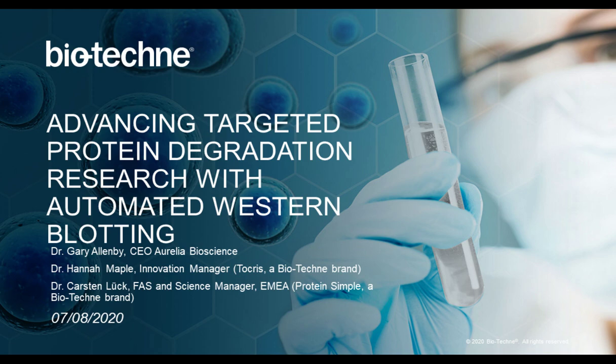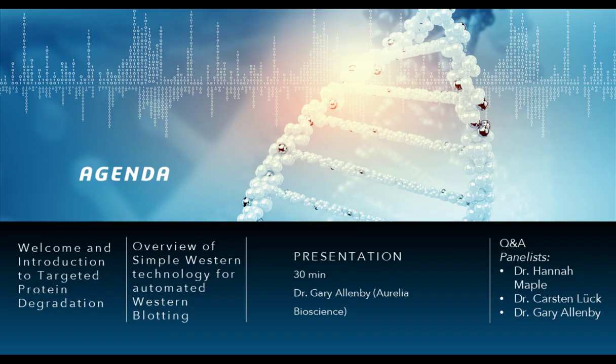This webinar will be approximately 1 hour long, and the agenda today is as follows. I will provide a short introduction to targeted protein degradation. My colleague, Carsten, will then provide an explanation of the simple Western technology that underpins the work that will be presented today. And then I will be inviting Gary Allenby from Aurelia Bioscience to present today's research talk. We will be ending with a live panel Q&A, so please do submit your questions to us using the Ask a Question box throughout the session. We'll answer as many questions as we have time for at the end of the presentation.